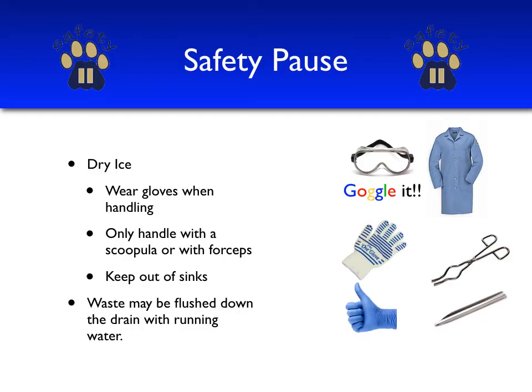To mitigate these hazards, we will make sure that we wear gloves when handling dry ice. We'll also only handle the dry ice with either spatula, forceps, or tongs. And we'll also keep dry ice out of sinks where it can combine with water to form large water/CO2 clouds, which can cause an asphyxiation hazard. It can also cause damage to the plumbing in the sinks.